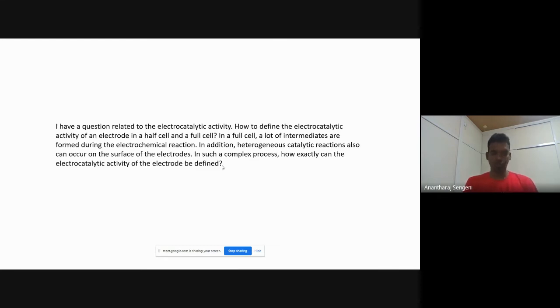But it is you who should ensure there is no dissolved oxygen and no organic impurities by choosing deionized water and what we call Millipore water, right, with high resistance value. So in those cases, the chances of having trace organic impurities are very low. By purging the electrolyte with an inert gas like nitrogen or argon, you can also ensure that the dissolved oxygen is expelled well before you perform the experiment.